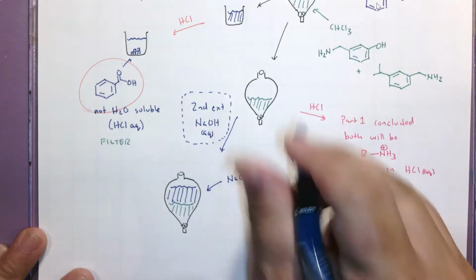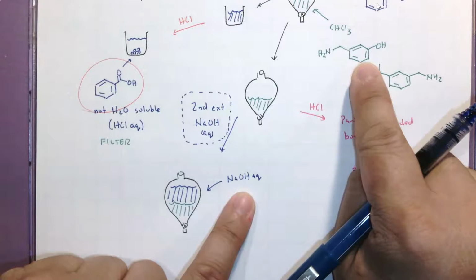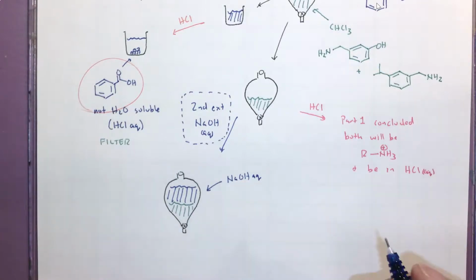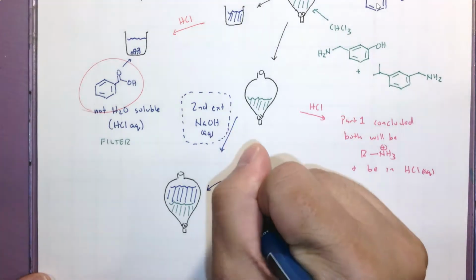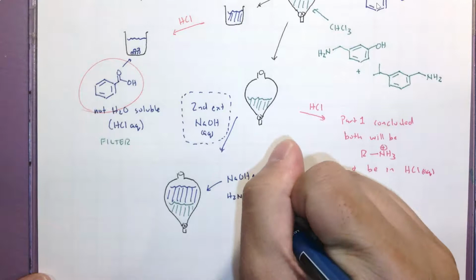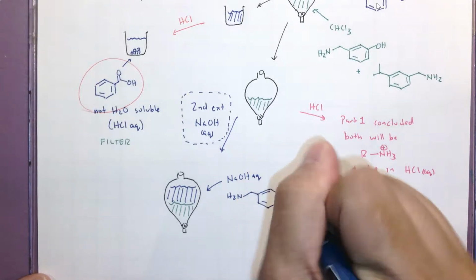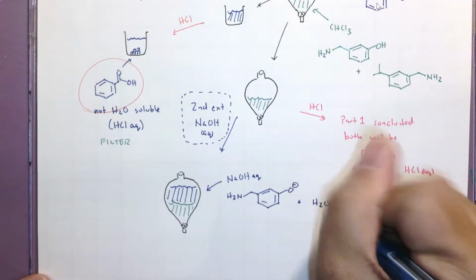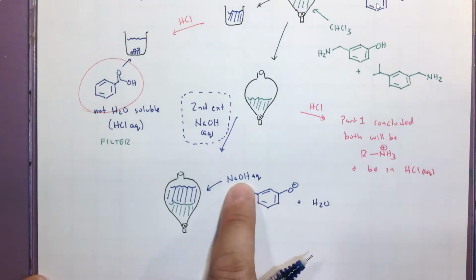Again, what's happening here is that when you mix this organic molecule and this NaOH, what is the result? The result is this molecule in blue, O minus, plus H2O. Remember, this H2O is the conjugate acid of the base.